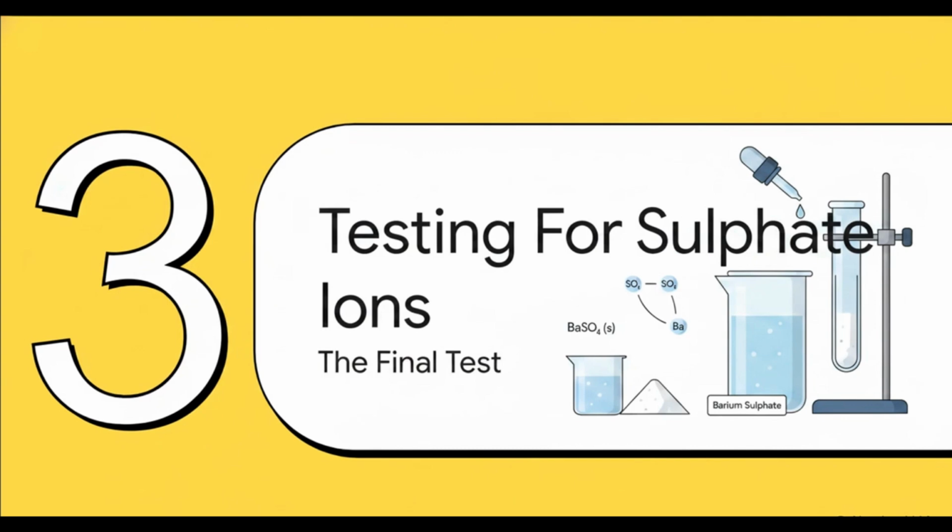Okay, time to add the last major tool to our chemical detective's toolkit. This test is for finding sulphate ions. And just like the halide test, it relies on forming a precipitate. It's a really reliable one.